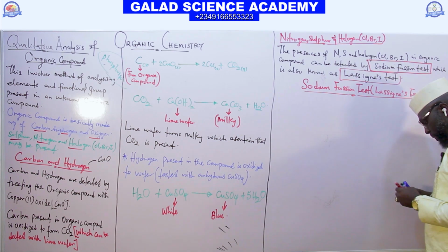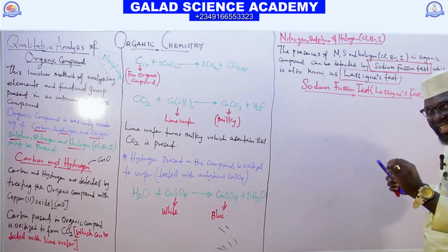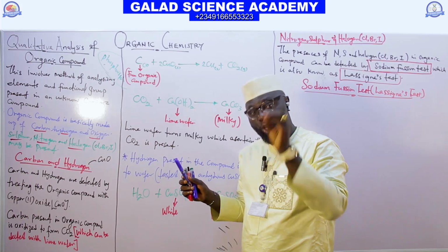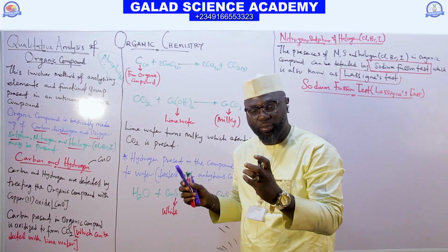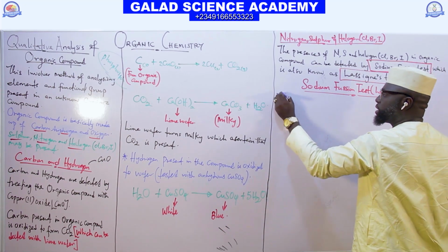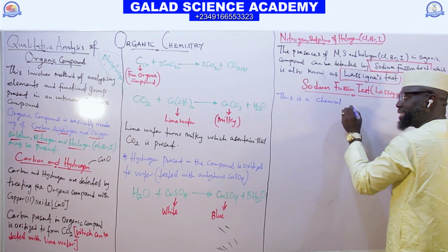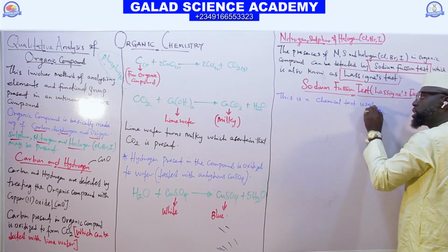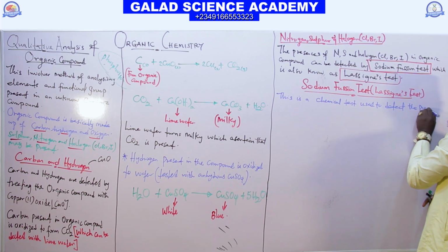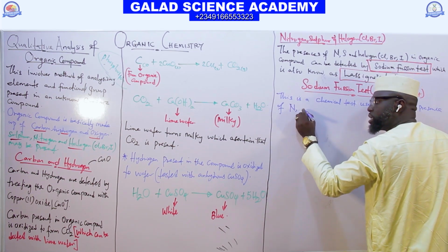And let us treat it. This is a chemical test that is used to detect the presence of nitrogen, sulfur, and halogen in an organic compound with the help of heated sodium.